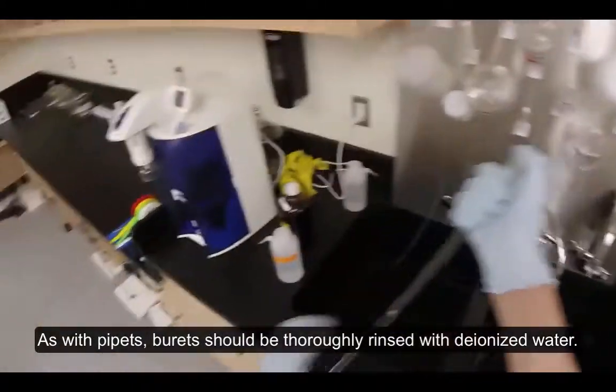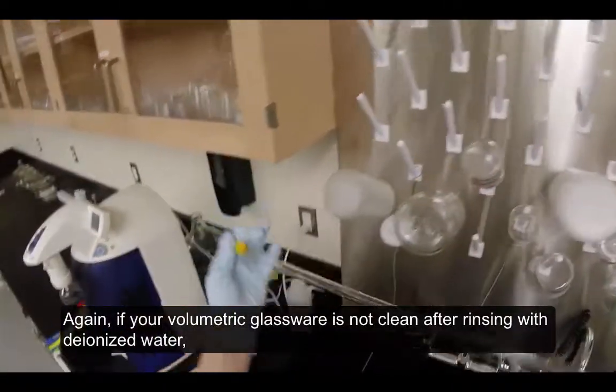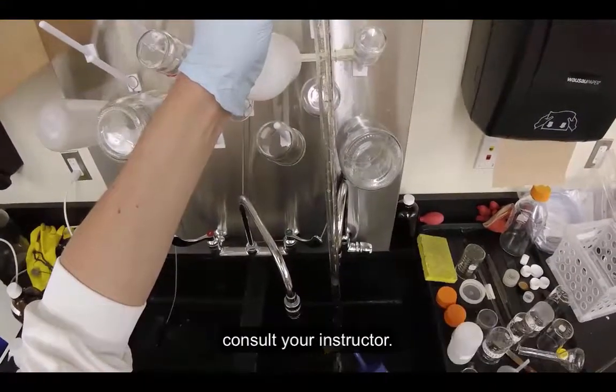As with pipettes, burettes should be thoroughly rinsed with deionized water. Again, if your volumetric glassware is not clean after rinsing with deionized water, consult your instructor.